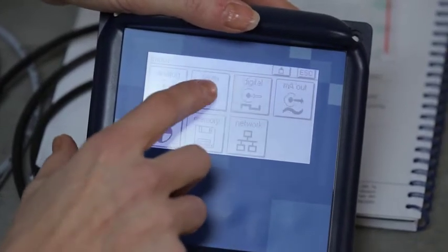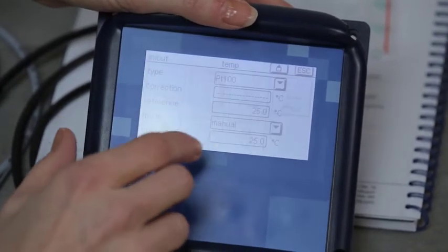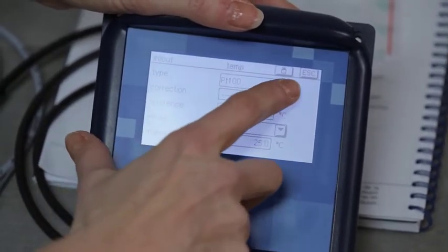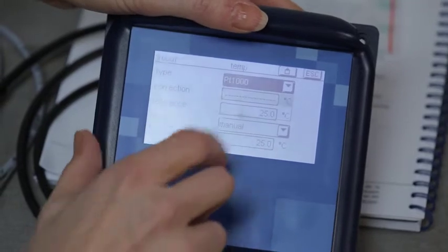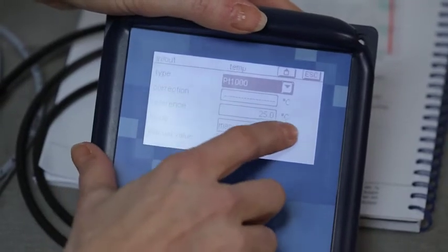Finally, set the device to PT1000 and the temperature to automatic mode.